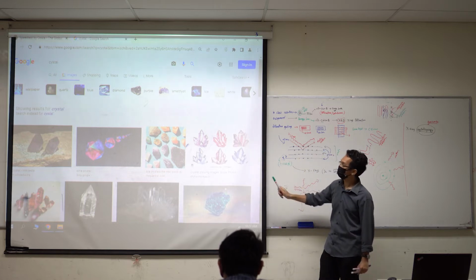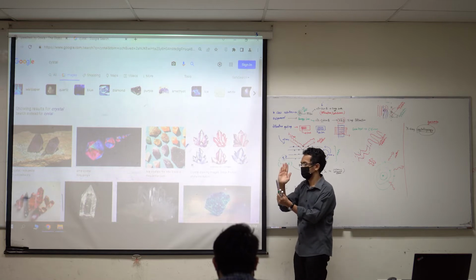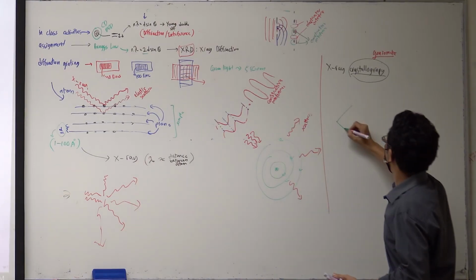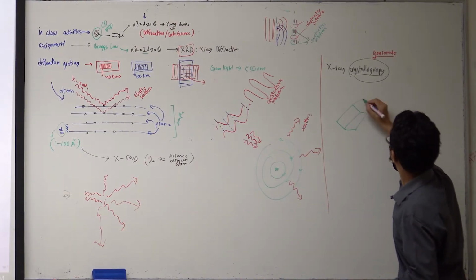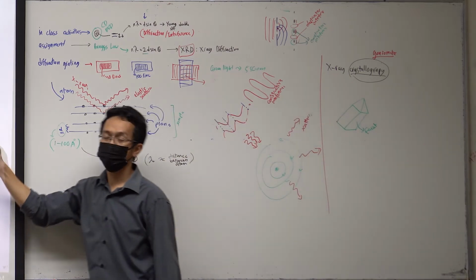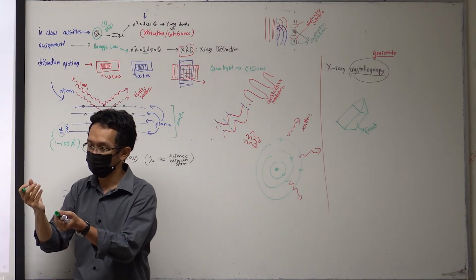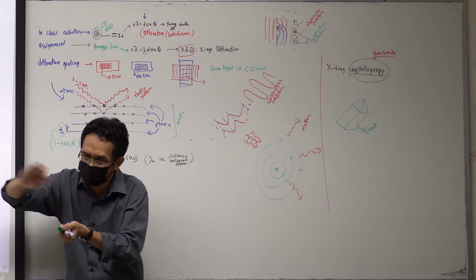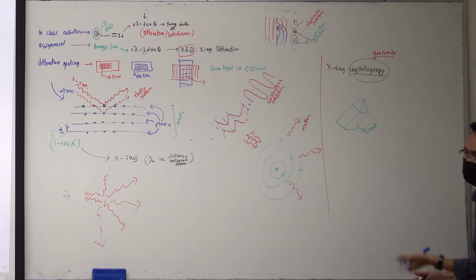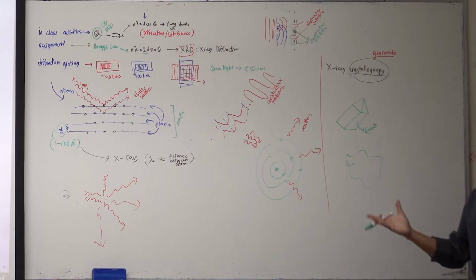The reason is that this edge we call a facet. This happens naturally. Normally, to get something like this you need human intervention to cut it. Because in nature, when you see sand or rock, it is normally something with no structure.